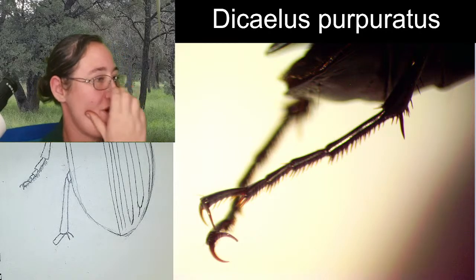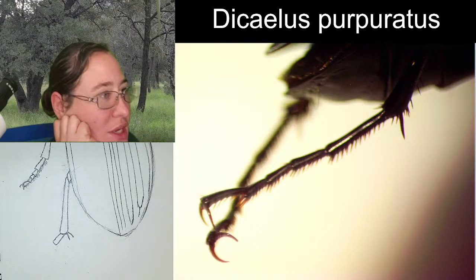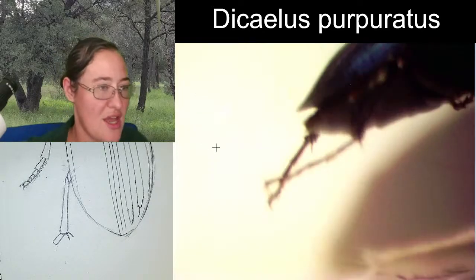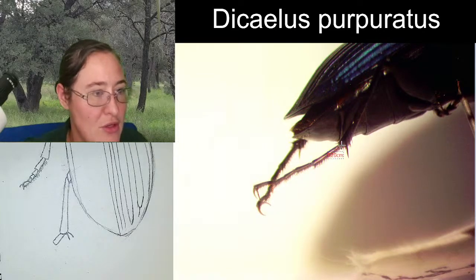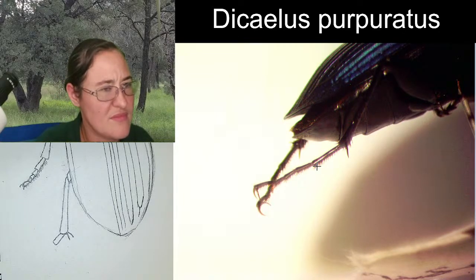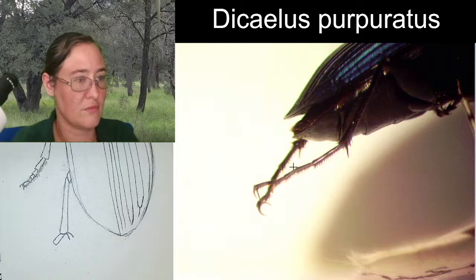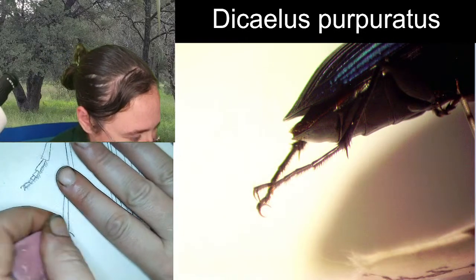Now there's a part of me that wants to know how long it is, but here, let me go ahead. I'm going to take this picture because I really like this focus, and then I can change it and not have to worry about it. I'm curious how long this first tarsal segment is so that I can base all of the other ones off of that measurement. And if I want it, you guys probably want it too. So it is 0.2 centimeters. So it is a lot longer than I just drew it. So cool.